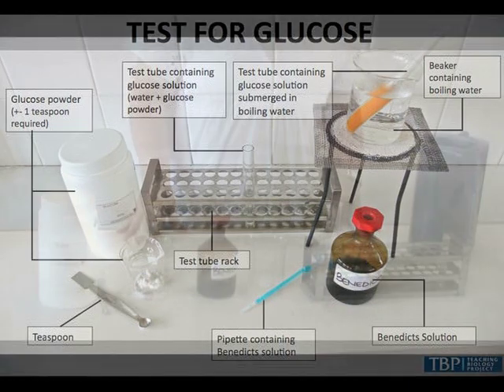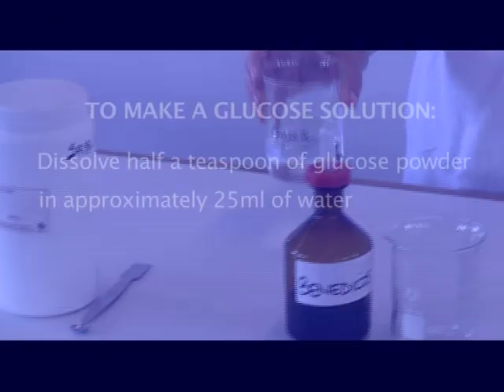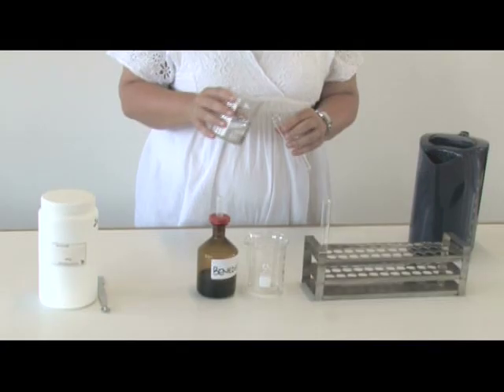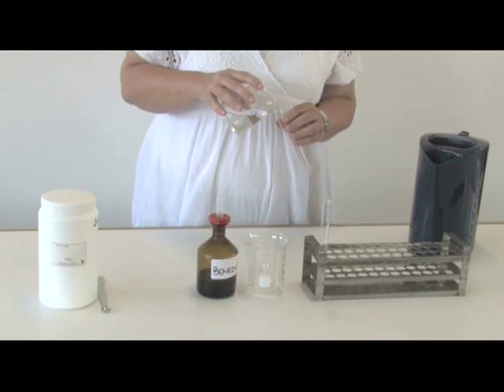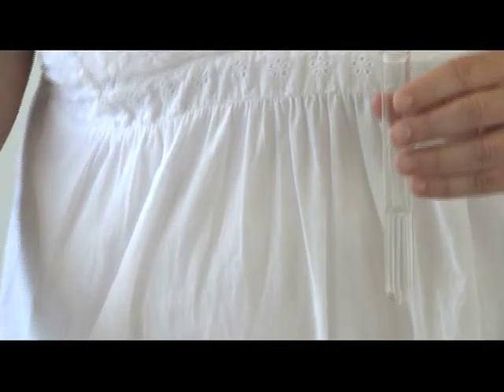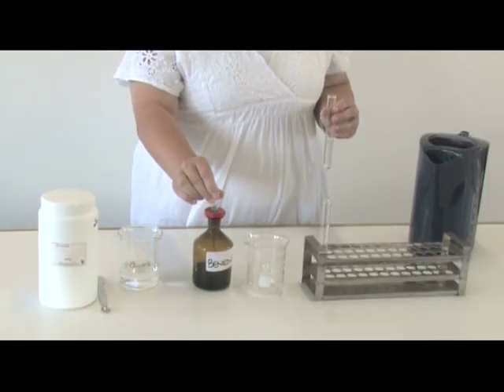For the glucose solution, you need to dissolve half a teaspoon of glucose powder in approximately 25 ml of water. Pour some of the glucose solution into a test tube to a depth of 2 to 3 cm — about half a finger.